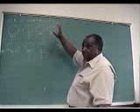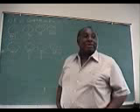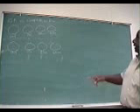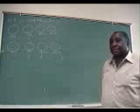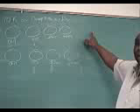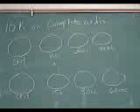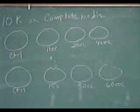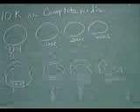I can compare this with my control as to how many cells grow, how many cells should have grown if it had not been for the UV. So what I expect is a decrease in the number of cells there. And probably, maybe at the high, if cells grew here, they may be mutant. So I can take cells from this one and put it on minimal media. If it doesn't grow, then that would be a mutation. We have induced a mutation. So that's what we want to do, is induce the mutation. Next week we'll test to see if we did induce a mutation.